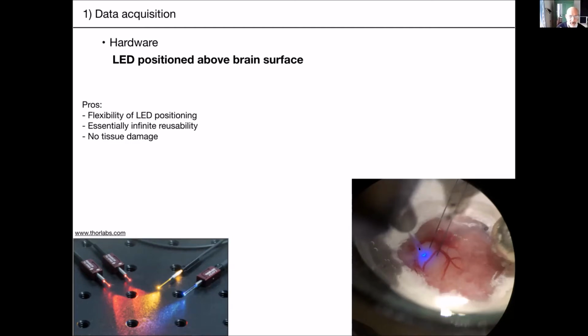I apologize. Yesterday, somebody asked this question and I gave them the wrong answer. I told them that this could not be done with Neuropixels 1. In fact, it can be done with a single manipulator if you glue 2 probes, one to the back of the other. Is it back to back or back to front? So the shank is at the top of the parallelepiped, so it's literally like that you stick them, top to top, so that the shanks can be closer to each other, because in this direction they would be too far from each other. Okay, top to top.